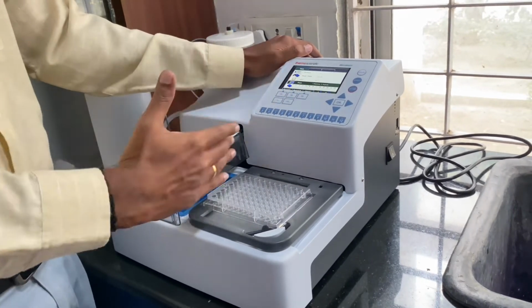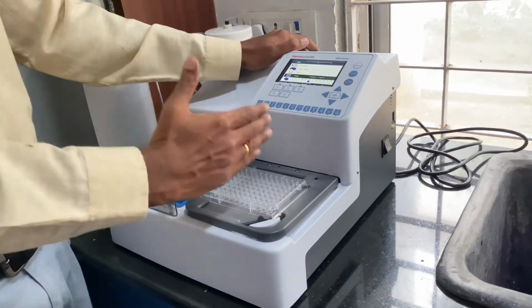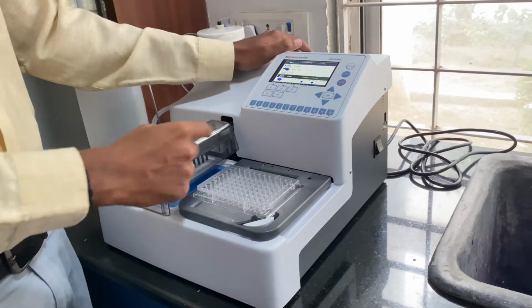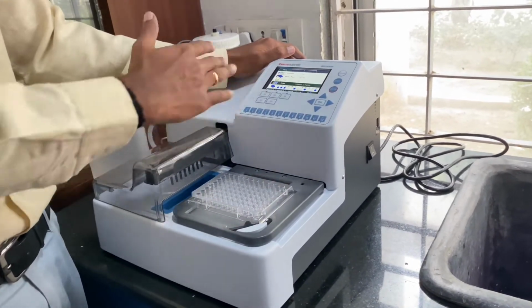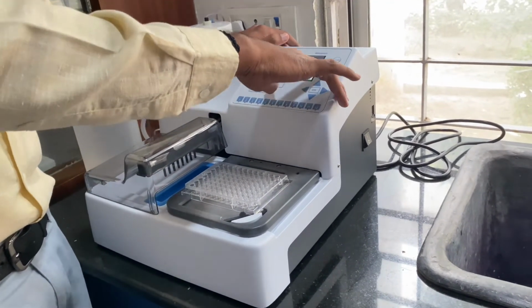Now we have to define which wells it is. So now I am having only 6. It will go only to the 6th position and it will do. If you are having 6 and 9, but if you are having all, you just select all. I am saying only these rows are having. Then I will say start.